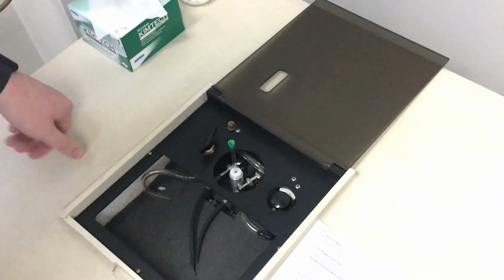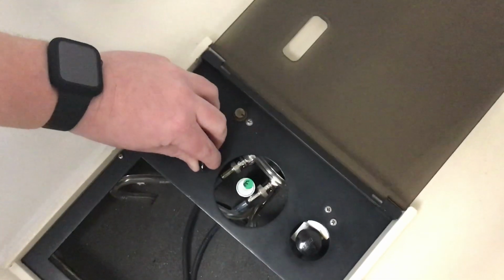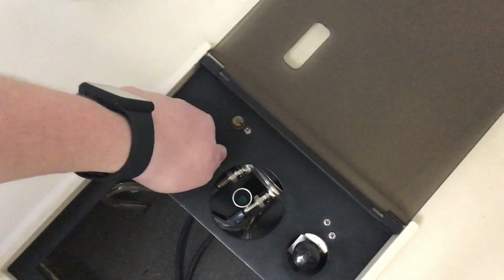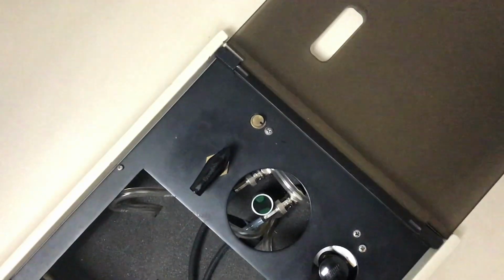So that way you can actually see the next part. Turn the air back down slowly to set it back down into the NMR. And then when it's down in the bottom, turn the dial back to 12 o'clock, going counterclockwise.